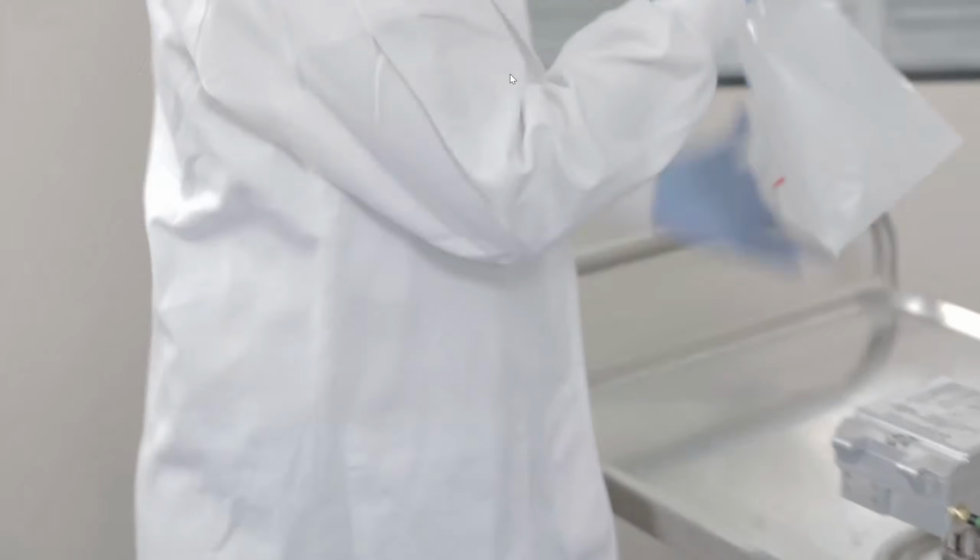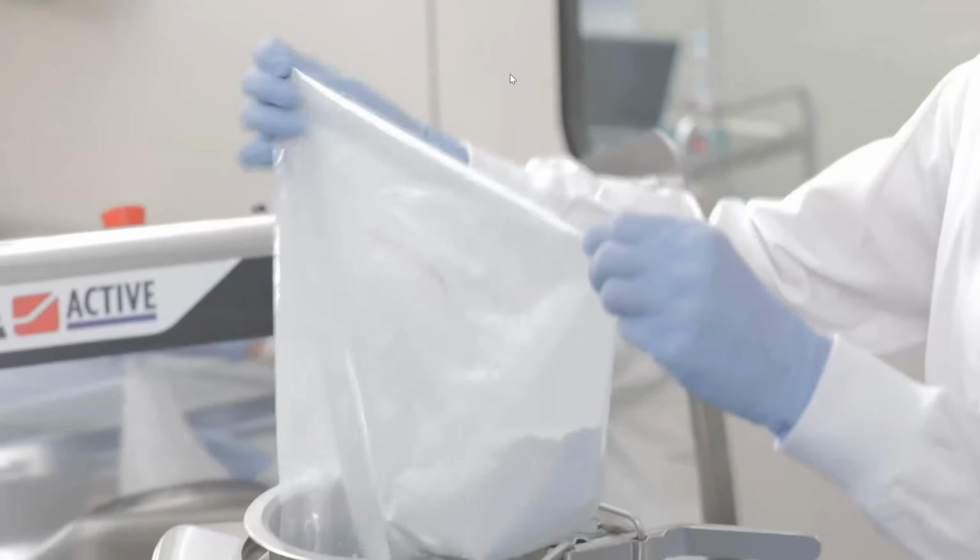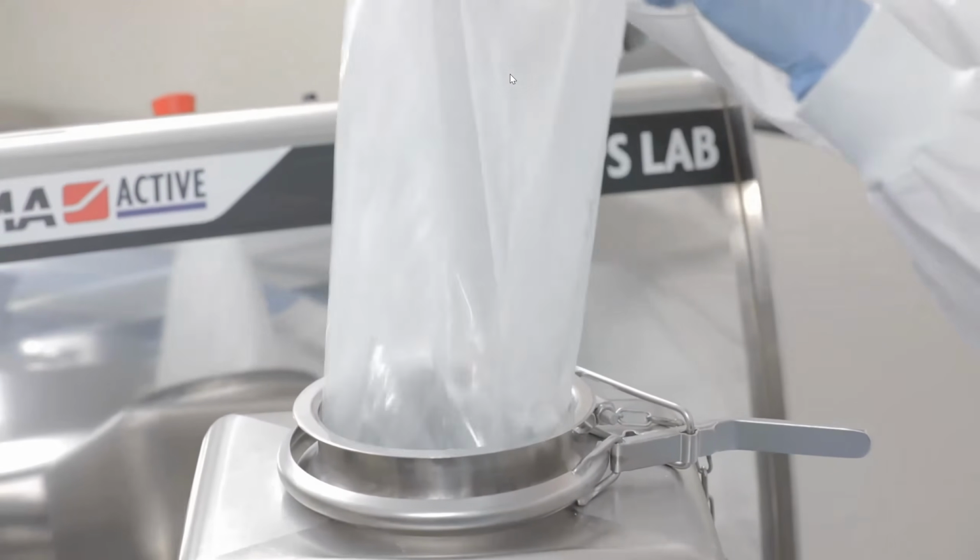The philosophy behind the application of the NIR spectroscopy to the bin blender is to use the NIR spectrum as a sort of fingerprint. In this specific case, we are mixing 2 ingredients, lactose and talc. Before adding the ingredient to the bin, we have recorded the NIR spectra. The gravity sensor embedded in the PATW and WX allows us to acquire a spectrum every rotation. In the beginning, the spectra will be for sure different, and afterward they will become more and more constant.